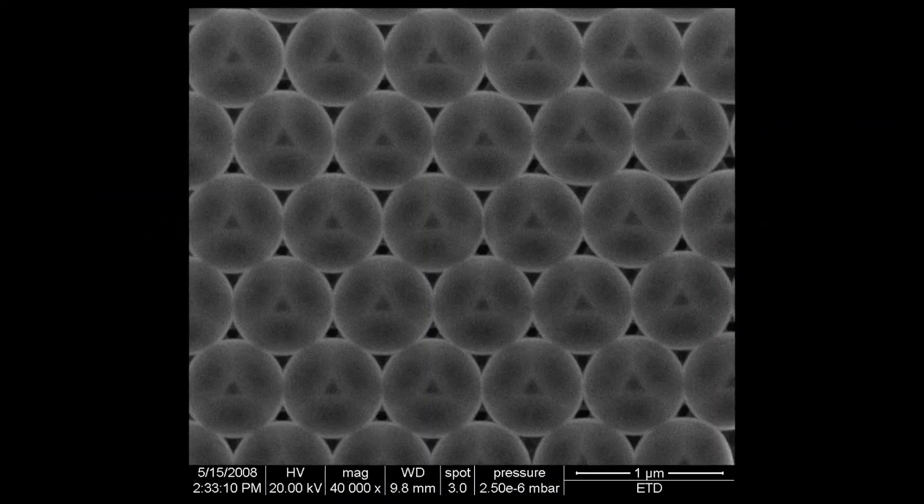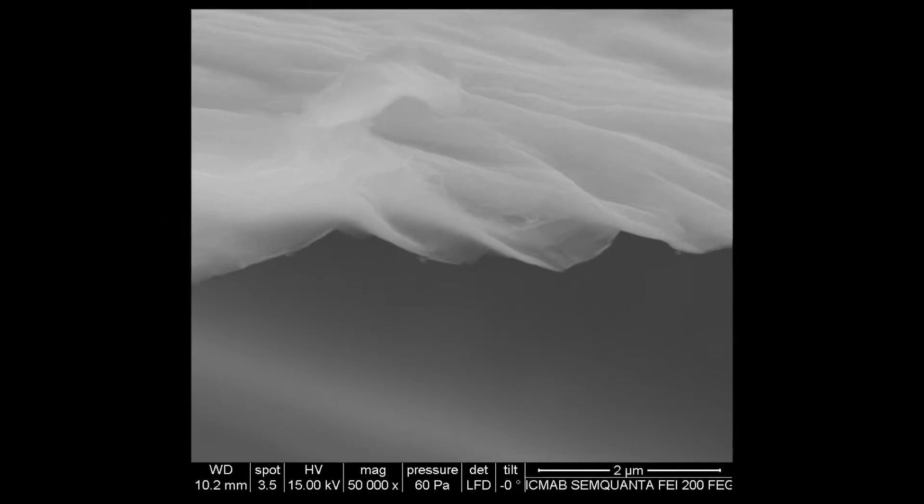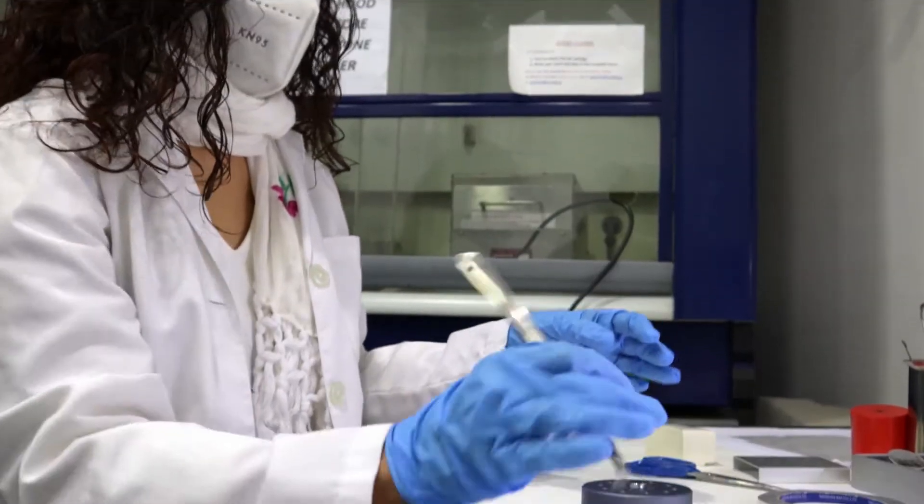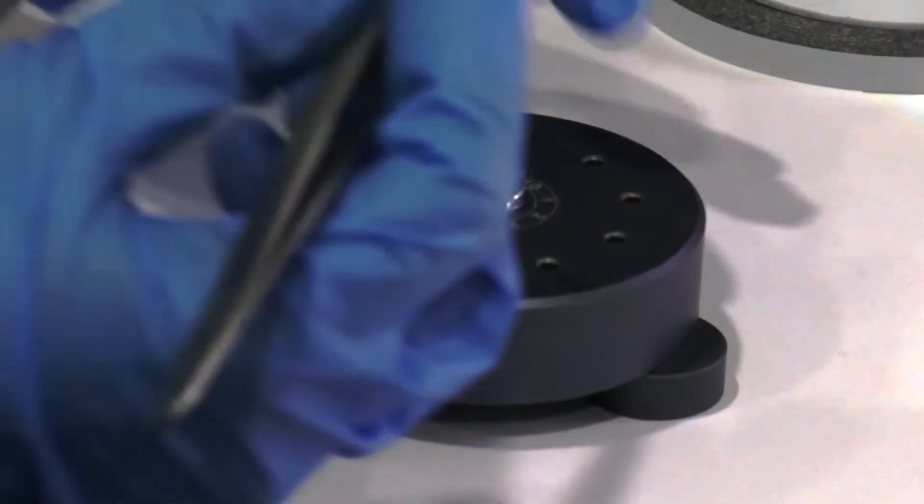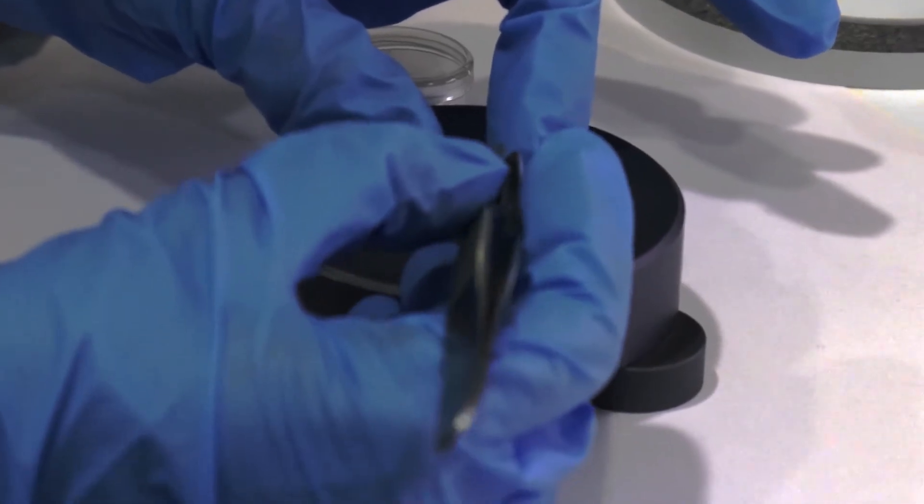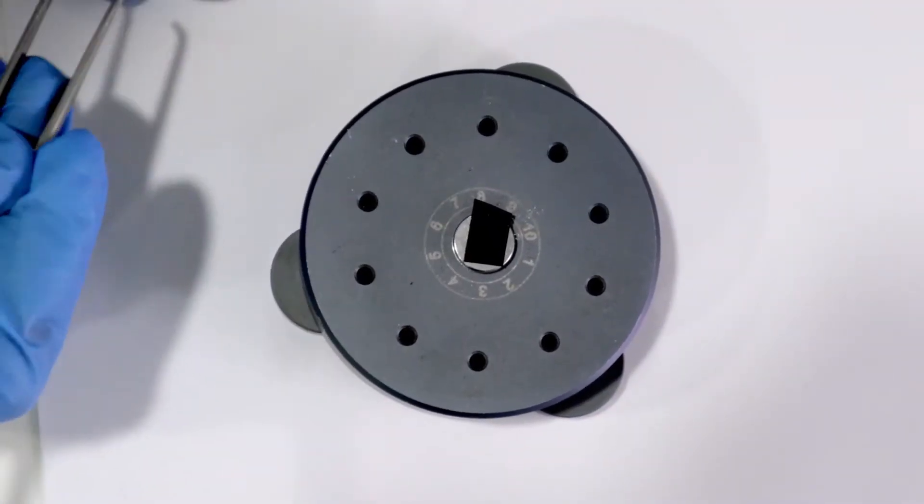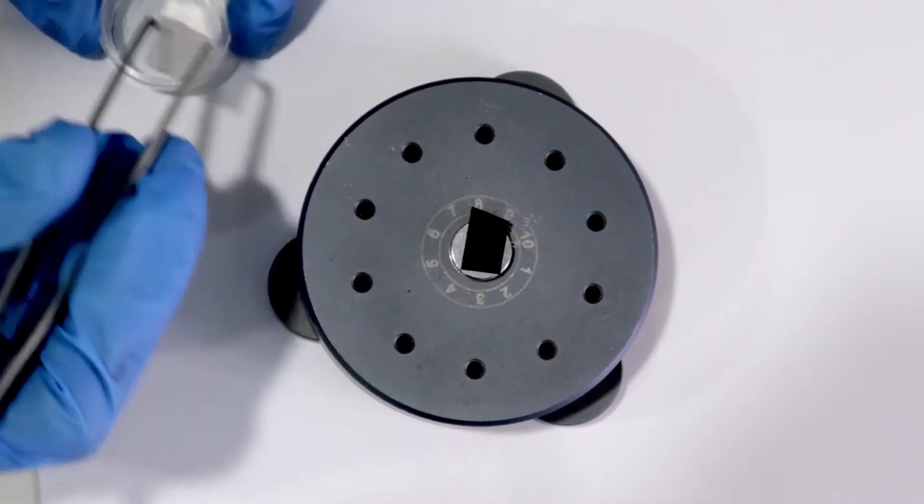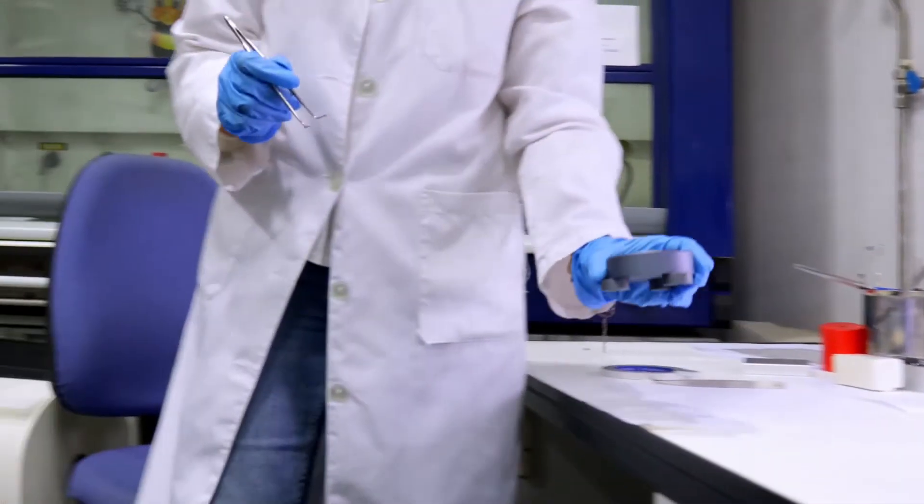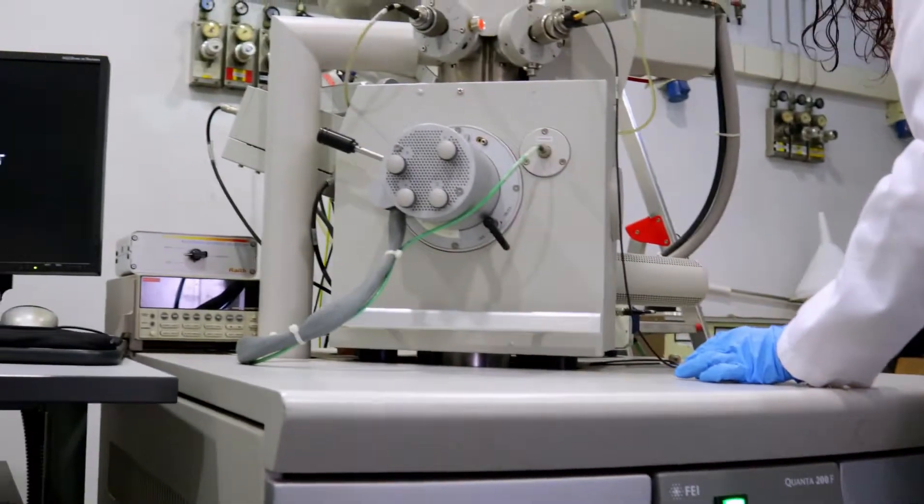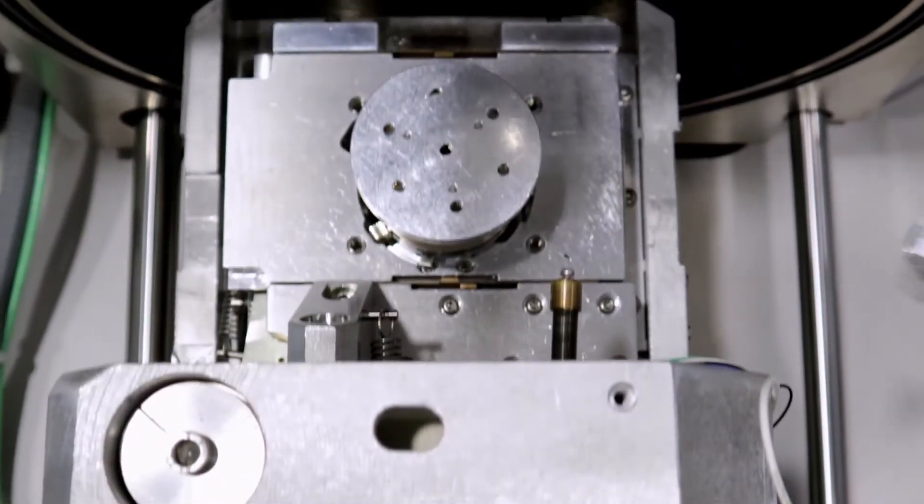SEM offers a powerful imaging tool to see and characterize surfaces, especially suited for analyzing the nanomaterials prepared in our labs. Before placing the sample inside the microscope, we need to prepare it so it can withstand the high vacuum conditions and the high-energy electron beam that will scan its surface.